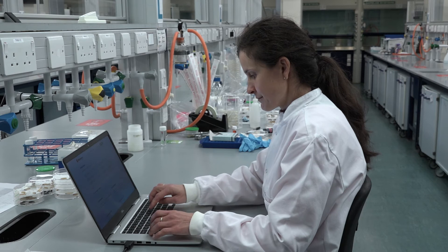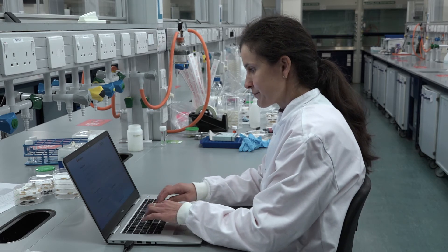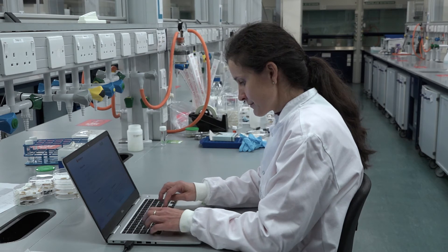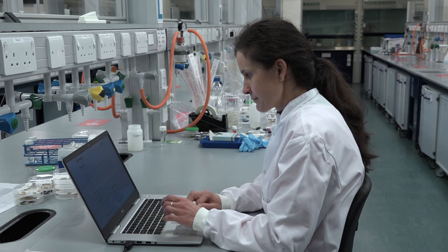Biosystems Technology dispatch larvae on Mondays, Tuesdays, and Wednesdays. Your order will arrive 24 to 72 hours after dispatch depending on the destination. We do not send larvae over the weekend.